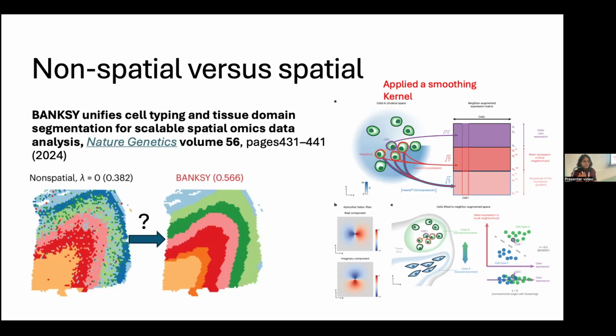And then the second level is, you also need to go to the GitHub repo and make sure that the authors are people who actually keep their GitHub repo updated. I think this is logical, especially for those of us who are not spending so much time on method development. We are applying, so we need to be logical in that as well.